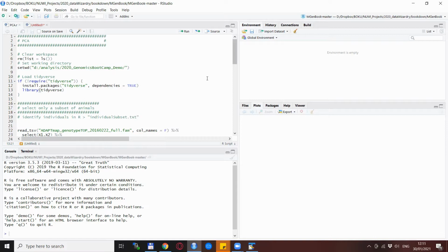So obviously I suggest you use the standard method, and the slightly dangerous and the very dangerous methods just in test cases, or if you want to do some very specific data extraction, but just for your own purpose and not some kind of work that you want to submit to any official place.